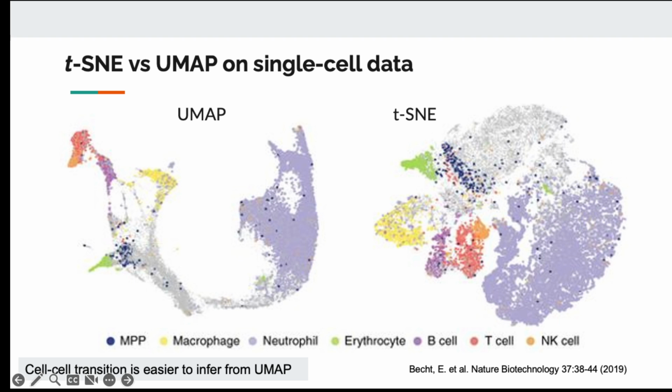Okay. So now we have seen the techniques that can allow us to summarize single cell transcriptomic data from thousands of measurements for each cell down to just X and Y coordinates. And we can still see meaningful biological information on the screen. So after we can visualize, what next can we do?